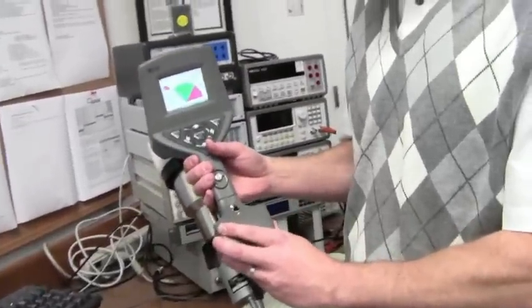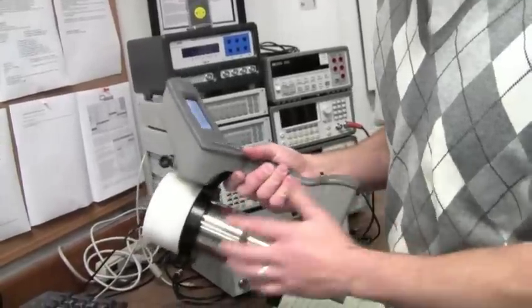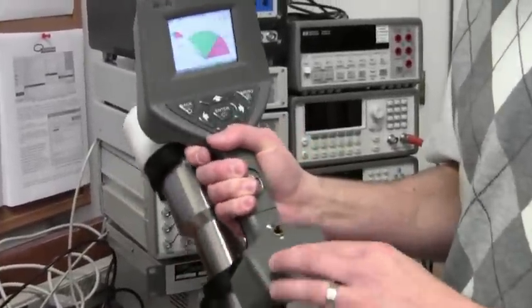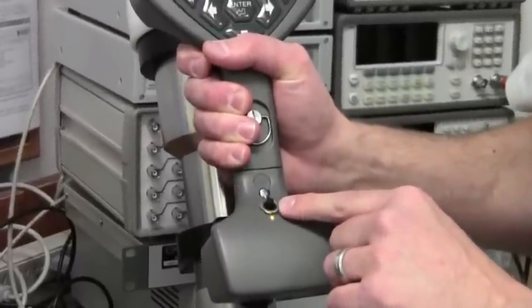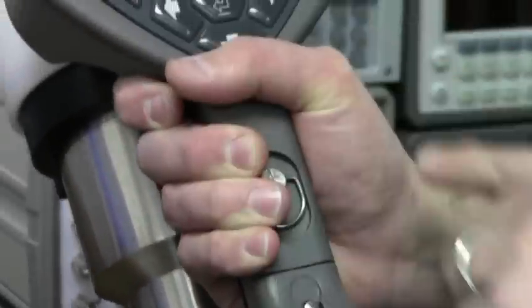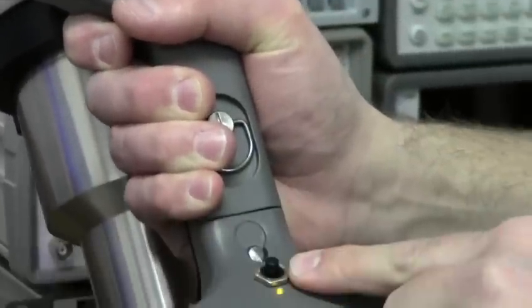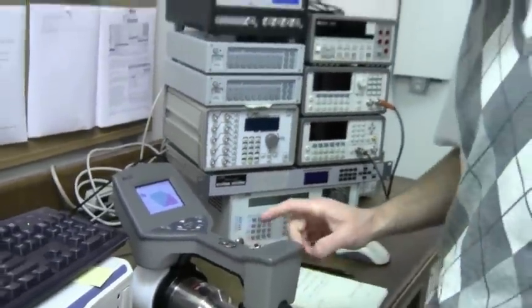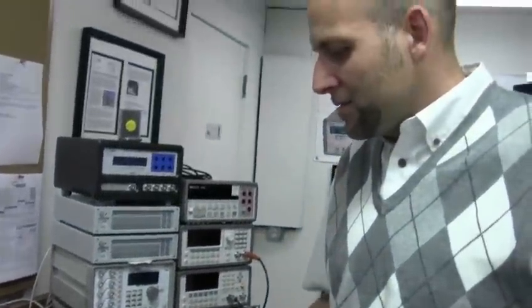I'll show you how it works. This is our SAM isotope identifier, the 940. Today we're using a 3x3 sodium iodide gamma and neutron detector. The wireless adapter is here and this is a power switch just for the wireless. So we have our regular power switch for the instrument and a power switch for the wireless. The wireless is an 802.11 standard Wi-Fi connection and reduces the battery life by about one hour, so we're specifying seven hours of uninterrupted use with the wireless feature on.